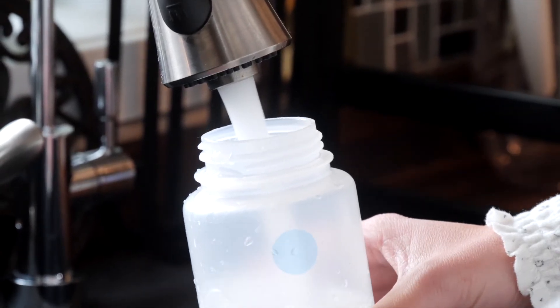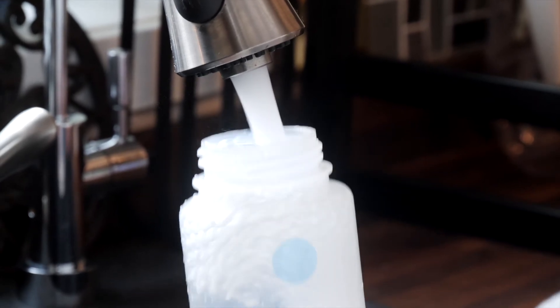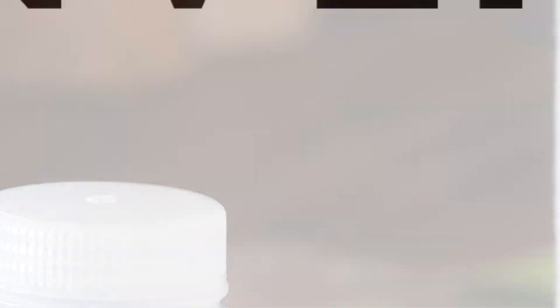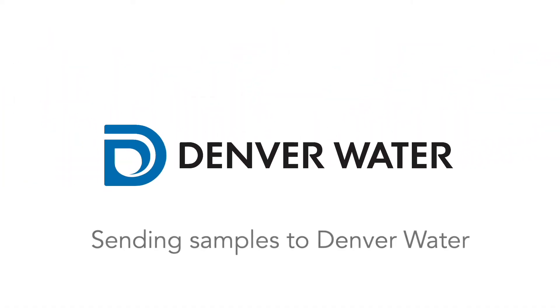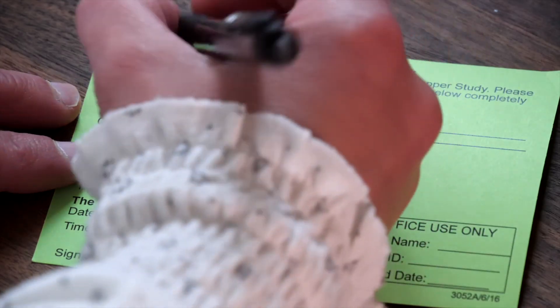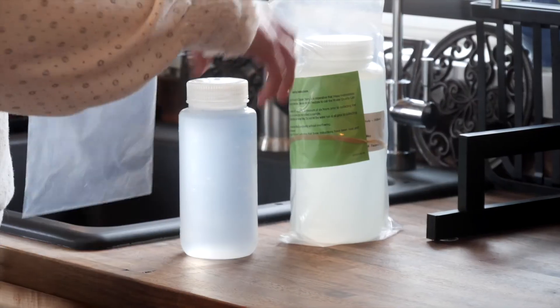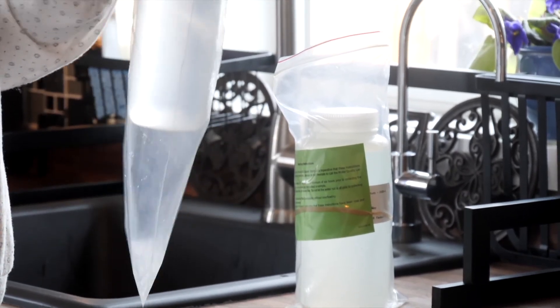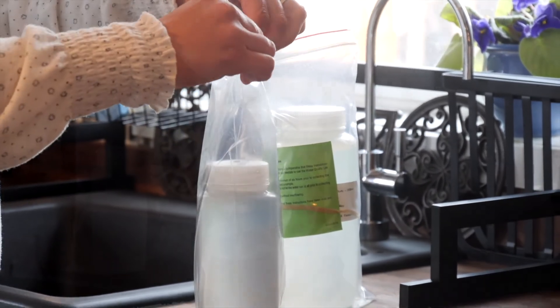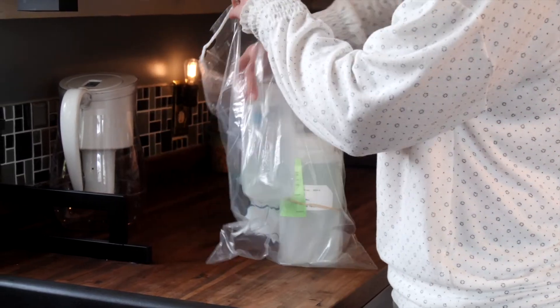Then fill the small bottle to the shoulder. Be careful not to overfill, and then remove the bottle from the flow. When you're done, go ahead and tighten the caps on both bottles. Now that you're done sampling, fill out the green information card. Wrap it around the large bottle with the rubber band and place it in the resealable bag. Then put the smaller bottle into the other resealable bag. And lastly, place both bottles into the large bag with the drawstring.